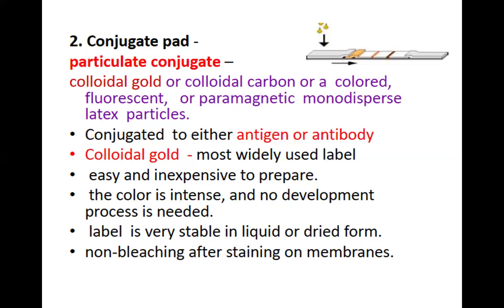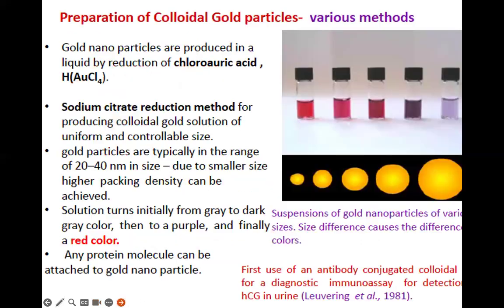You don't need to worry about that. We thought at the beginning when we worked with lateral flow of using a complicated chemistry, but when we did that, it did not perform well. So finally, we just use a simple chemistry. It works, so no need to worry about the complicated chemistry.